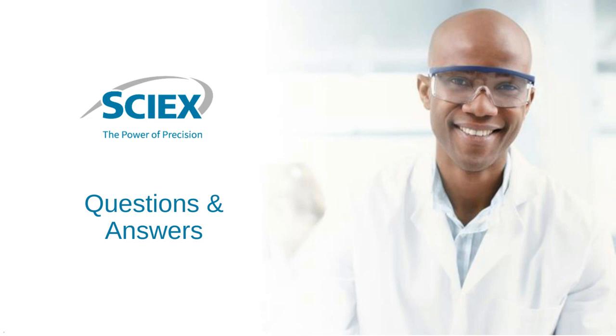Great, thank you. It looks like we have time for one more question. Since the vial caps for the samples were traded for a 96-well plate, are the solution buffer vials also replaced with 96-well plates?